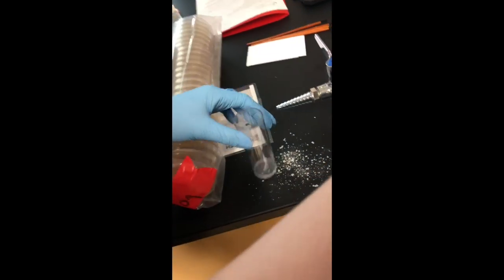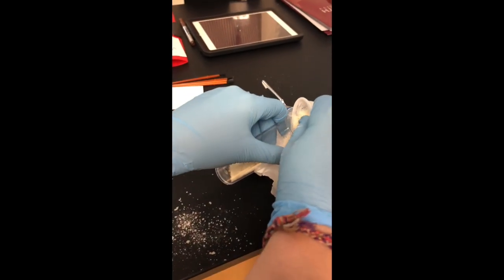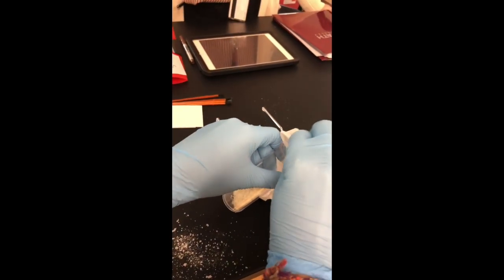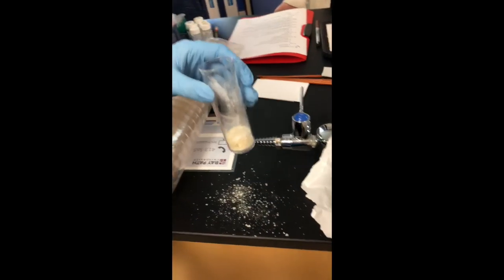To begin the experiment, the media was made. 1 scoop of potato mix and 1 scoop of water were put into a large test tube. Then 5 yeast pellets were added as well.